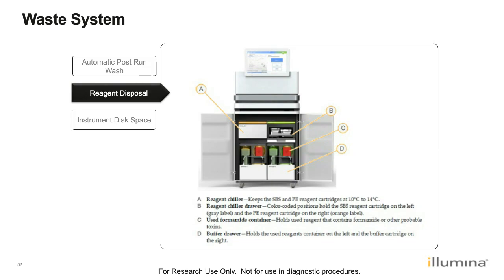So as a refresher, the spent reagents are separated into non-hazardous and spent formamide reagents via the large and small spent reagent containers. We do highly recommend that these are emptied between each run. The small spent formamide reservoir contains about 90 milliliters of waste per run. Of this volume, about 10% is formamide, and the other 90% is wash buffer used to clear the instrument fluidics. The drawer pulls out for access to the large non-hazardous spent reagents.